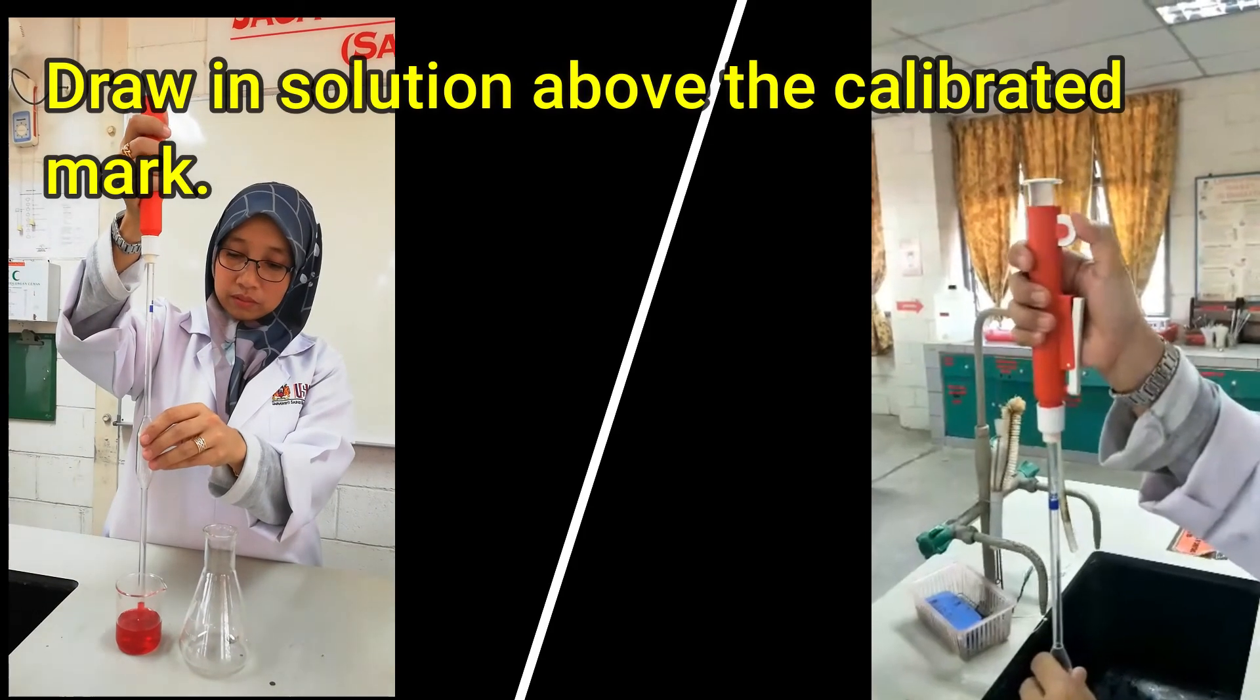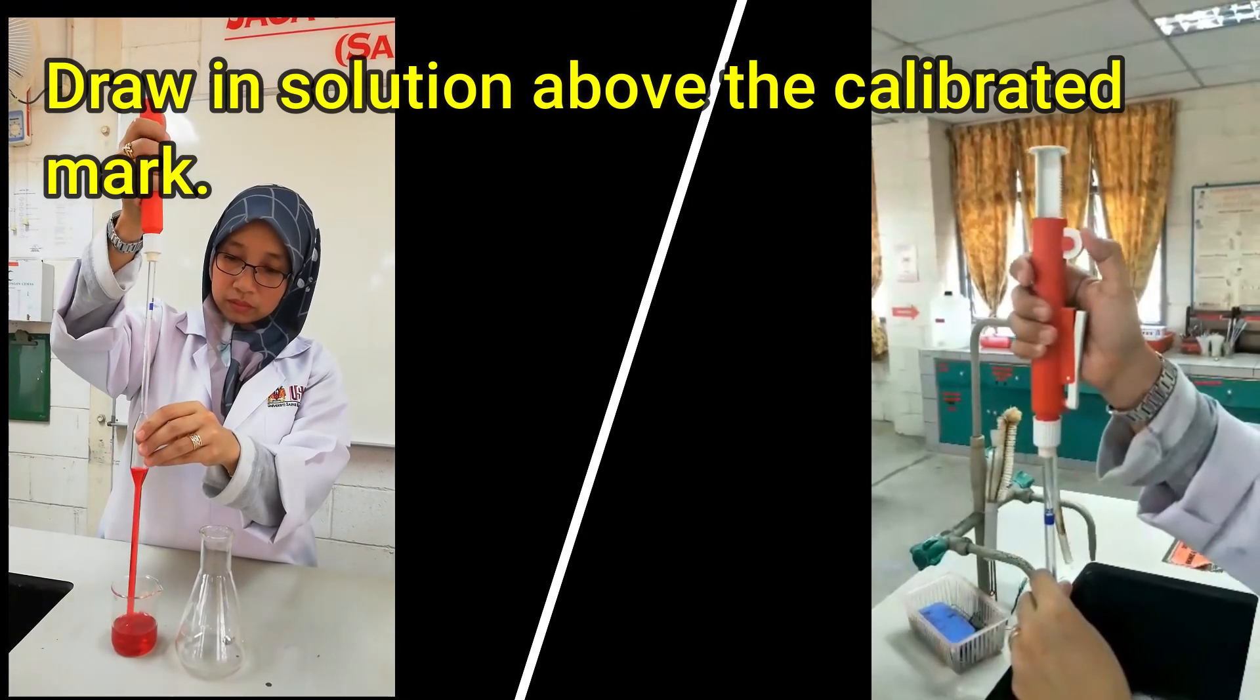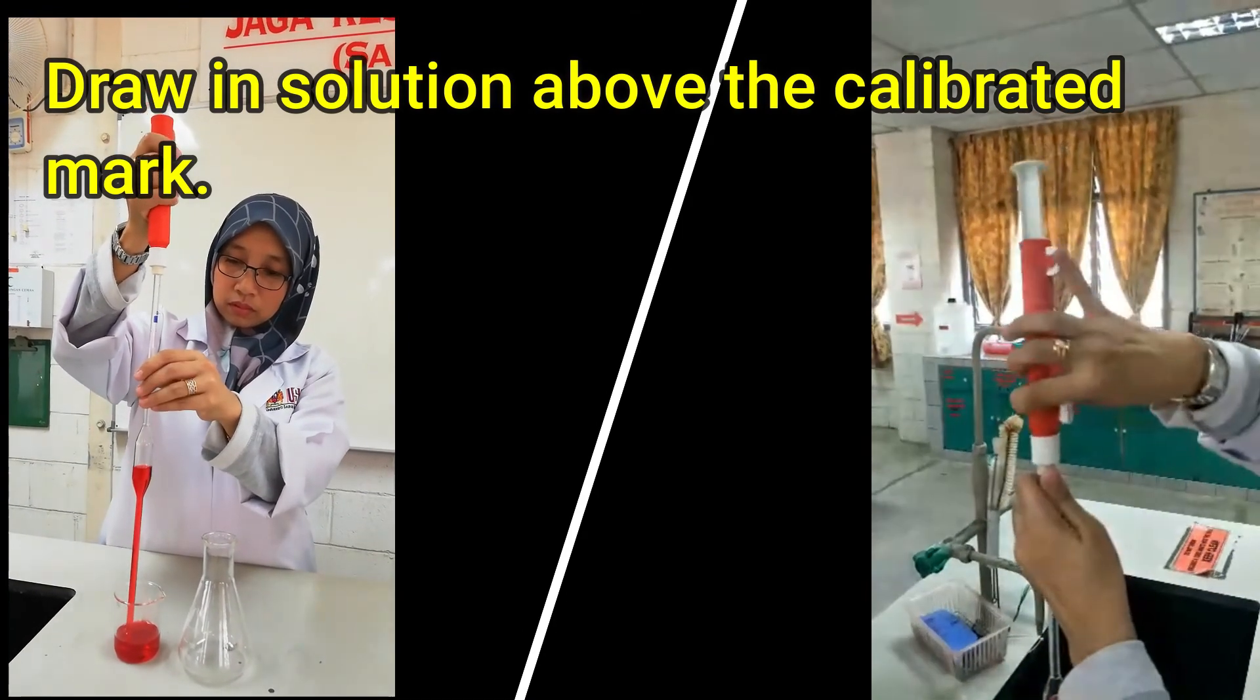Pour slightly more than the required amount of the solution into a beaker. Dip the tip of the pipette into the solution. The tip should be placed well below the surface of the solution. Use a pipette filler or bulb to draw in solution above the calibrated mark.